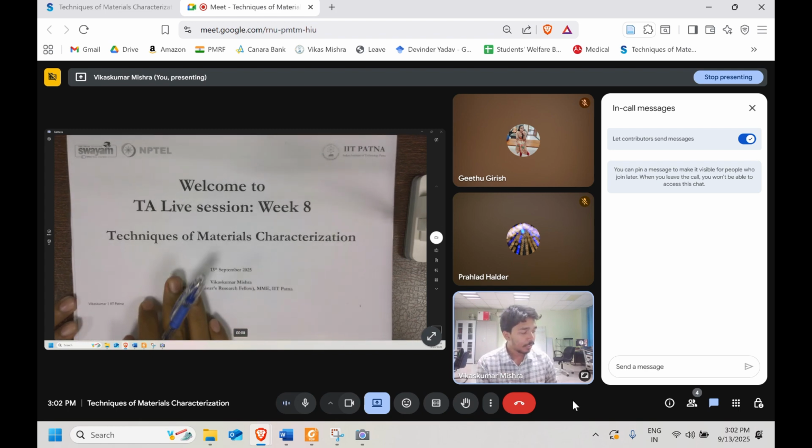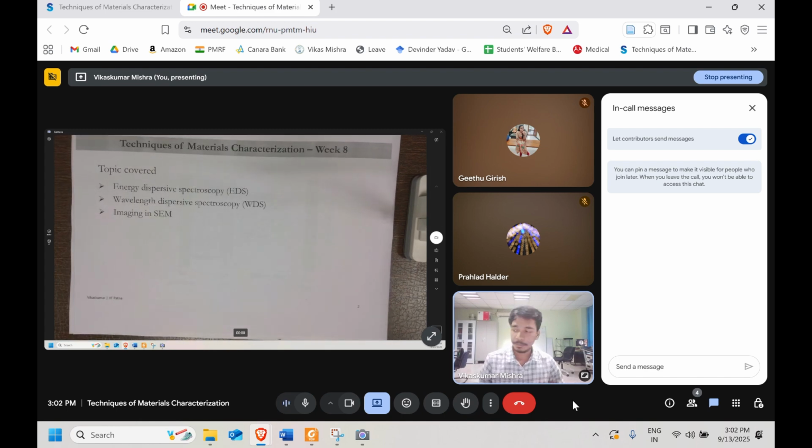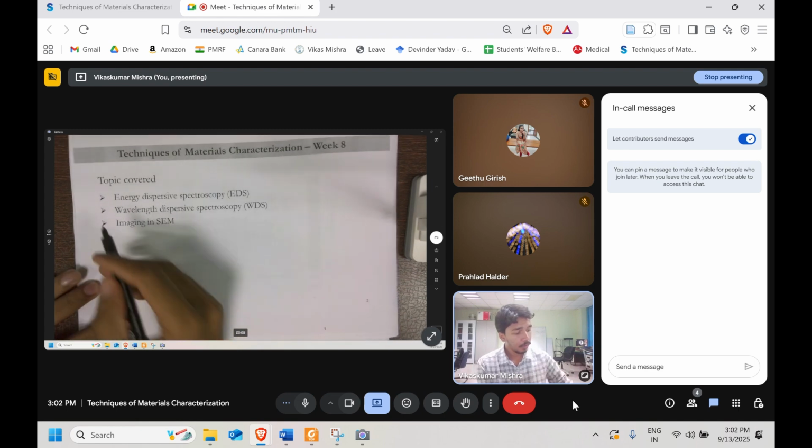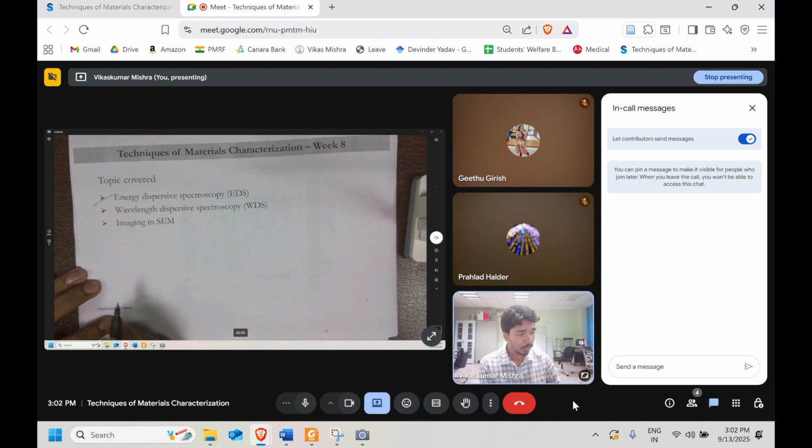So let's proceed further. Let's see what content has been covered in this week. We discussed energy dispersive spectroscopy, EDS, and wavelength dispersive spectroscopy.